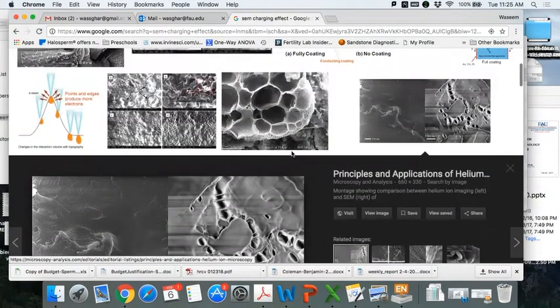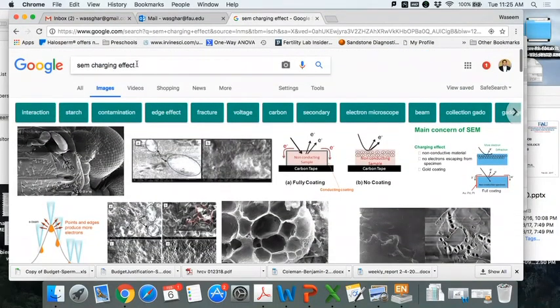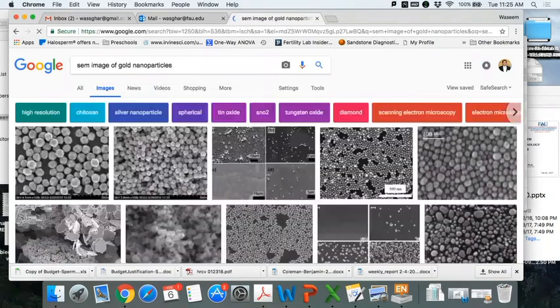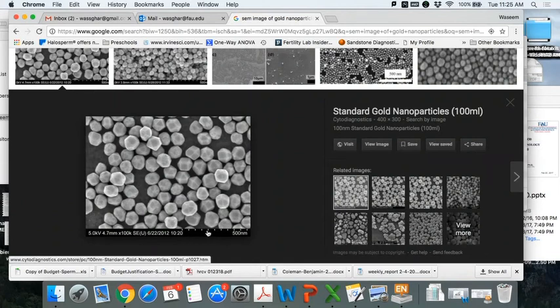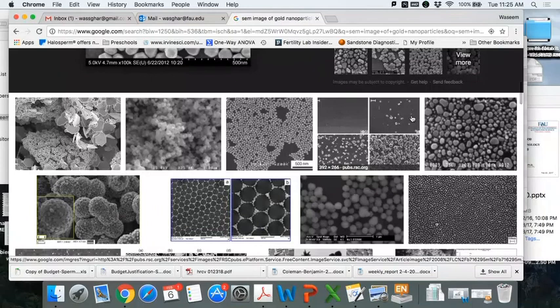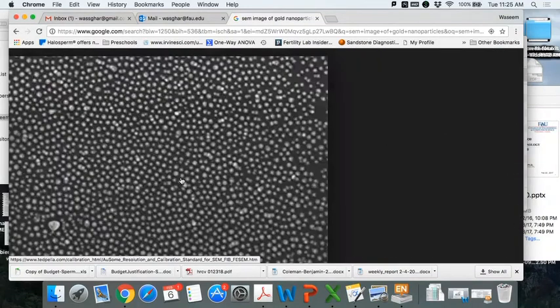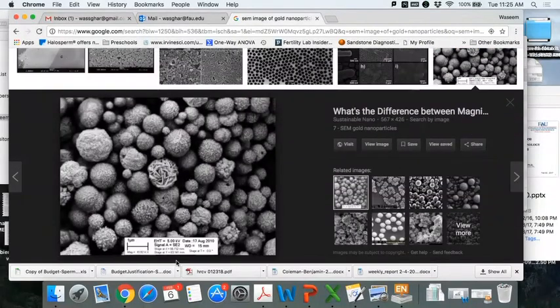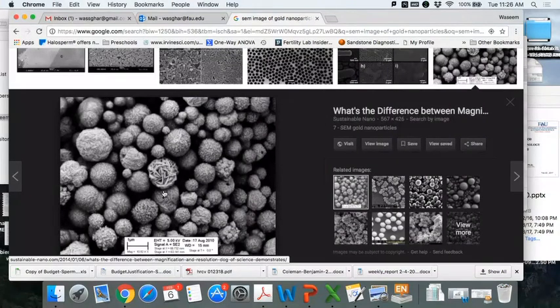With non-conductive materials you see charging, but with conductive materials like gold nanoparticles you get excellent images. These particles are 15 nanometers and you can see the resolution achievable with this electron microscope - you can even see different crystal faces of the gold nanoparticles. With a large image we can still see fine detail because the material is conductive, so there's no charging effect.